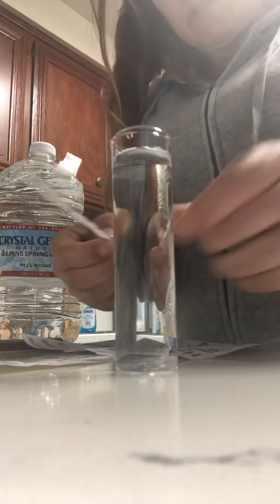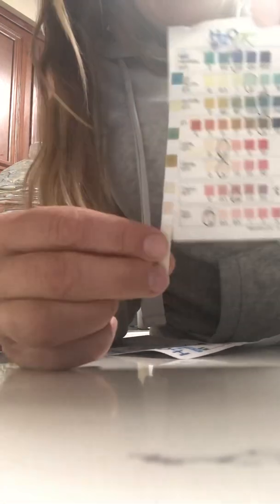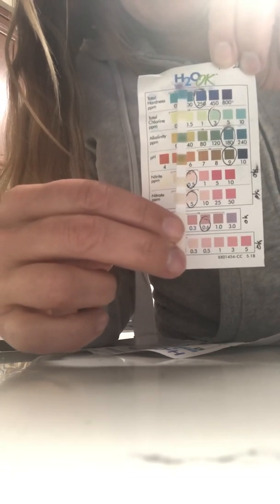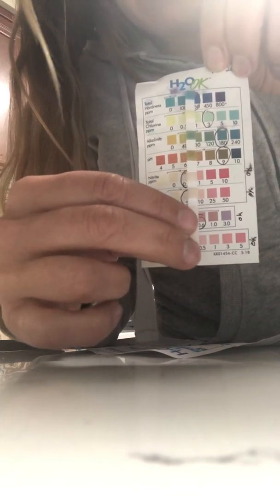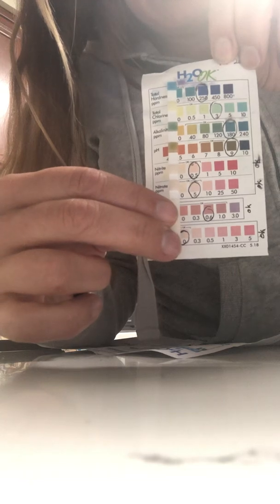Let me show this to you. The circles on here are from the actual tap water in our Rancho Palos Verdes. But this one right here — you can see this one falls under 100, the next one falls under 1, the next one falls under 80, and then this one falls under 7. And then the last two are zeros — look at that! So it actually looks like it passed everything. Is that amazing?